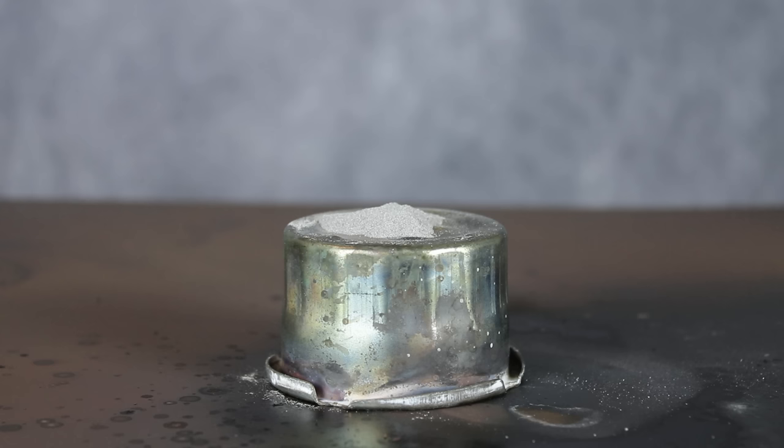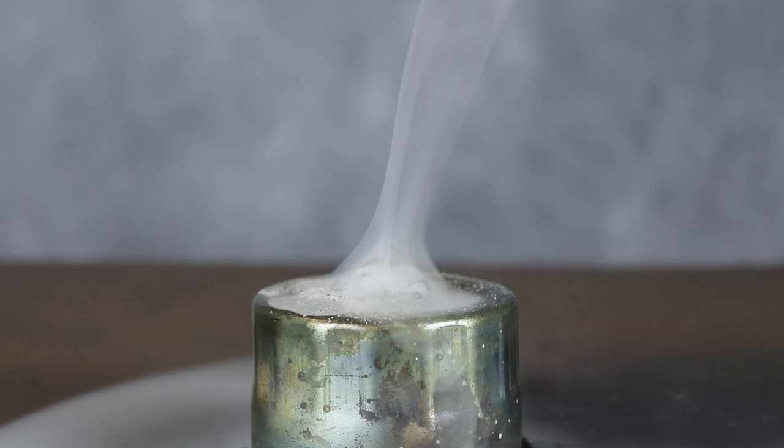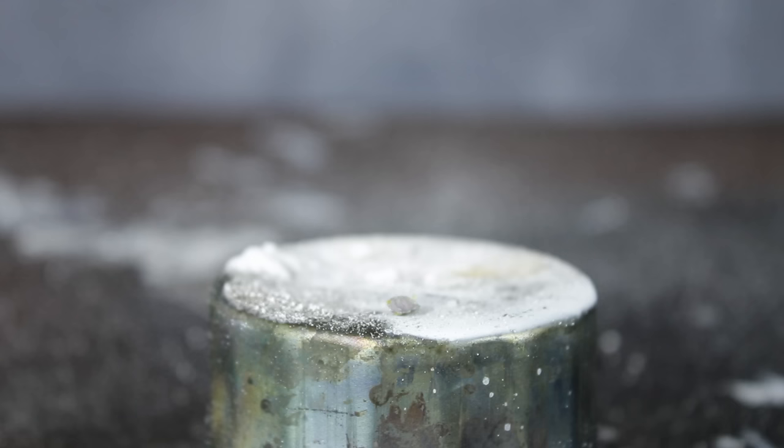Alright, one last reaction. Let's see how the superacid reacts with a reactive metal, specifically magnesium powder. Hmm, that's kind of weird — it just smoked a little. Maybe introducing a bit of fire will make things more interesting. Yep, that definitely made things more interesting. It's honestly impossible to convey just how insanely bright this was in person. Magnesium — you never fail to put on a show.